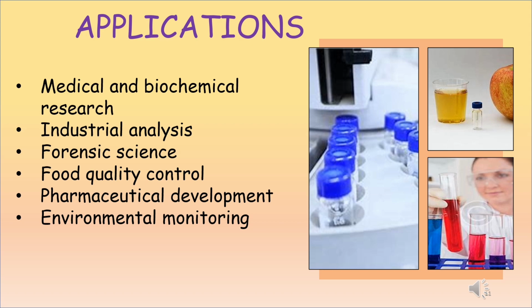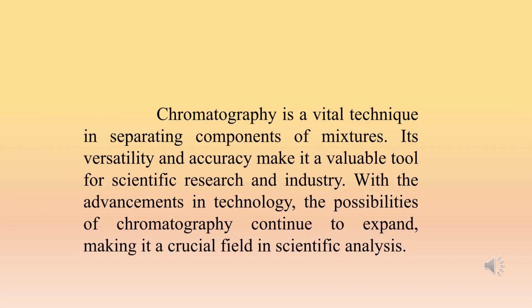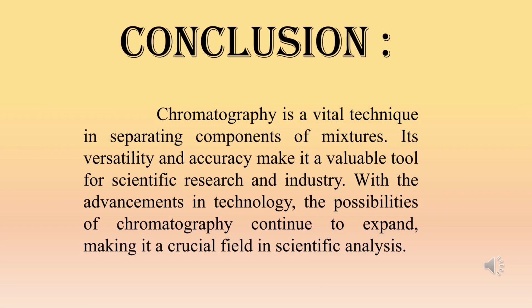Applications of chromatography. Chromatography is a versatile and powerful technique that has a wide range of applications in many different industries such as medical and biochemical research, industrial analysis, forensic science, food quality control, pharmaceutical development, environmental monitoring, and so on. In conclusion, chromatography is a powerful tool in the field of scientific analysis.